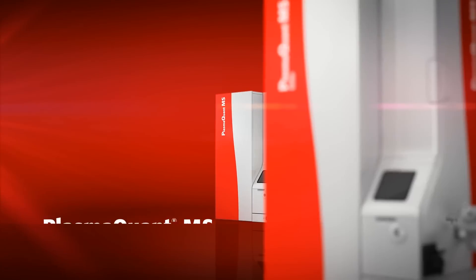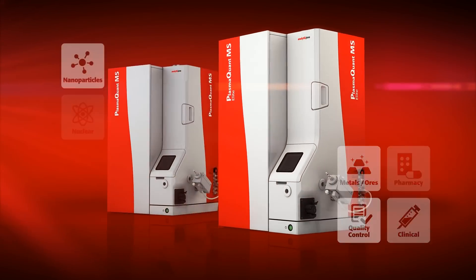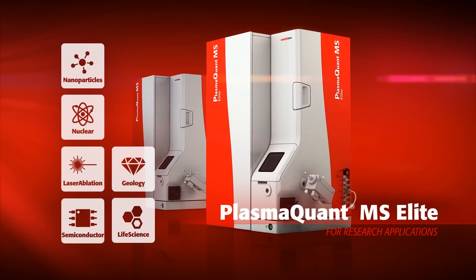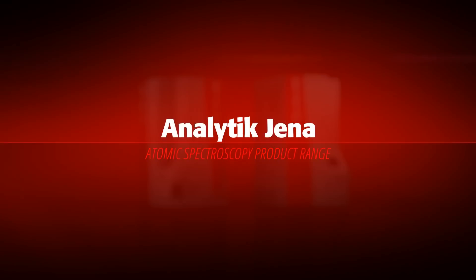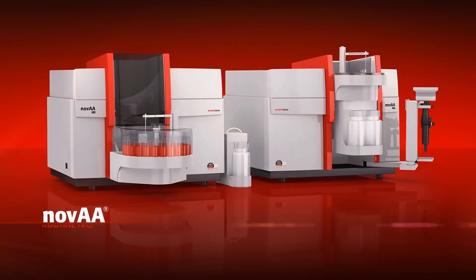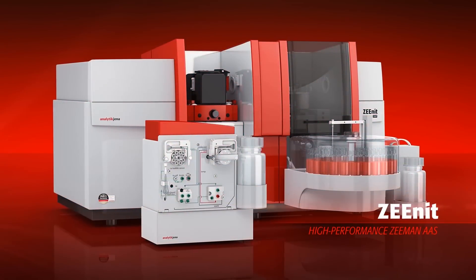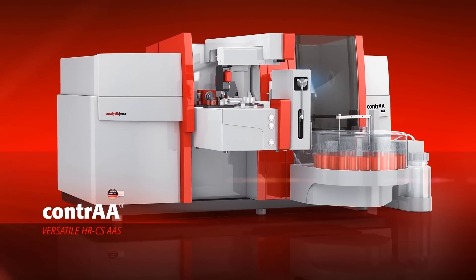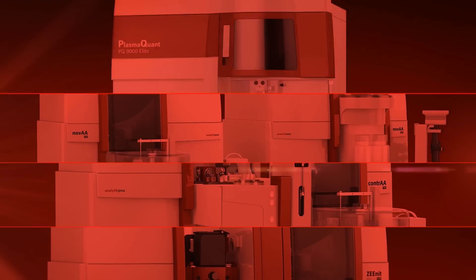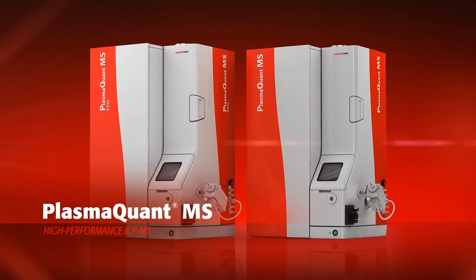With two models to choose from, Analytic Jena has the solution to your routine and research application needs. The PlasmaQuant-MS broadens Analytic Jena's innovative range of atomic spectrometers. Recognized as a global leader for innovation and quality, Analytic Jena once again demonstrates its ability to deliver products that exceed your expectations.